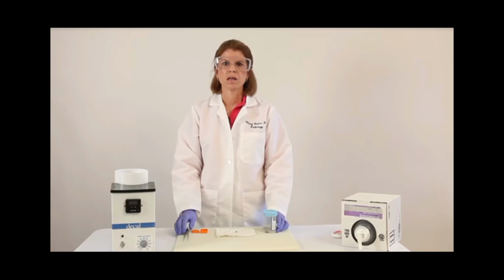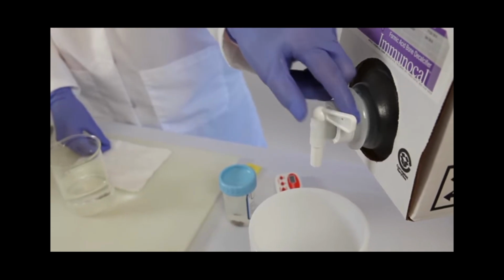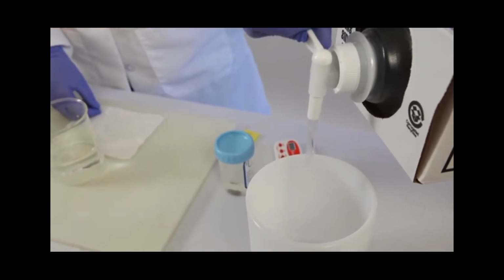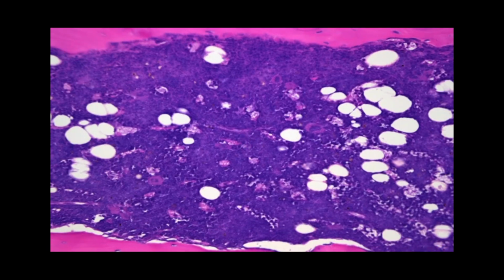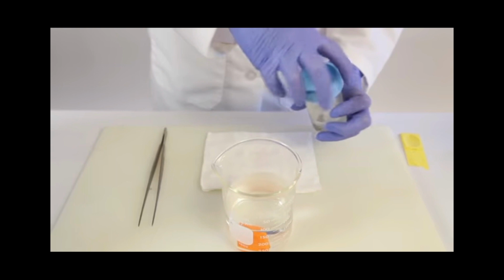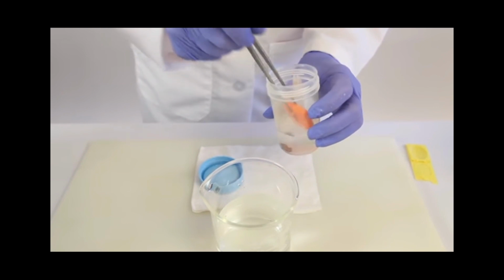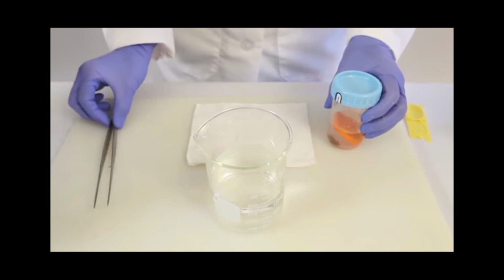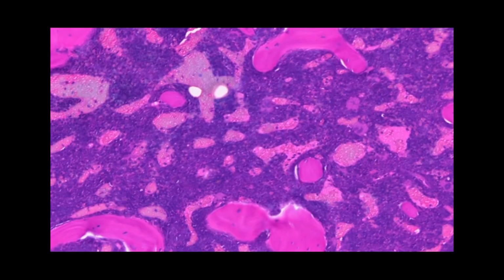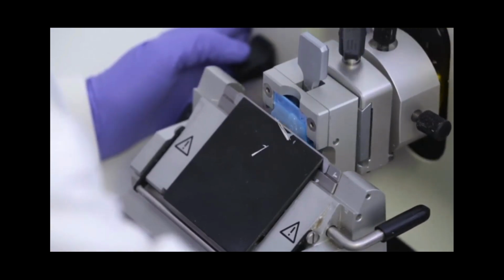So again, what is decalcification? This is the procedure whereby calcium or lime salts are removed from the tissues following fixation. Decalcification also, class, prevents obscuring the microanatomic detail of the sections by bone dust and other cellular debris. Inadequate decalcification may result in what? Poor cutting of hard tissues, and there will be damage to the knife during cutting. So your microtome will be damaged, and remember that the microtome is very expensive.